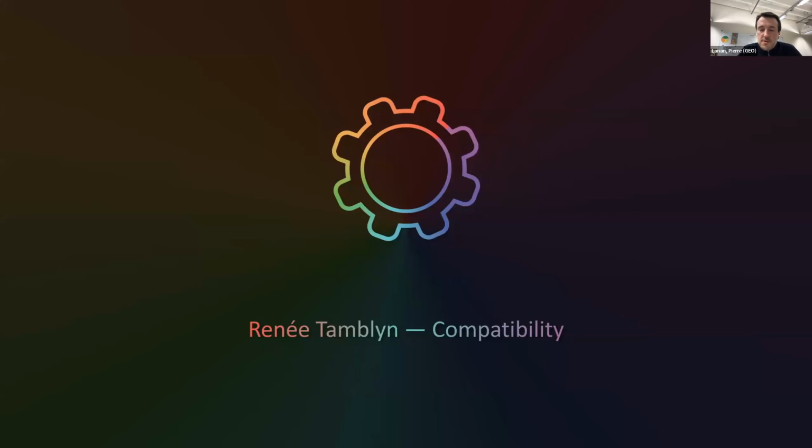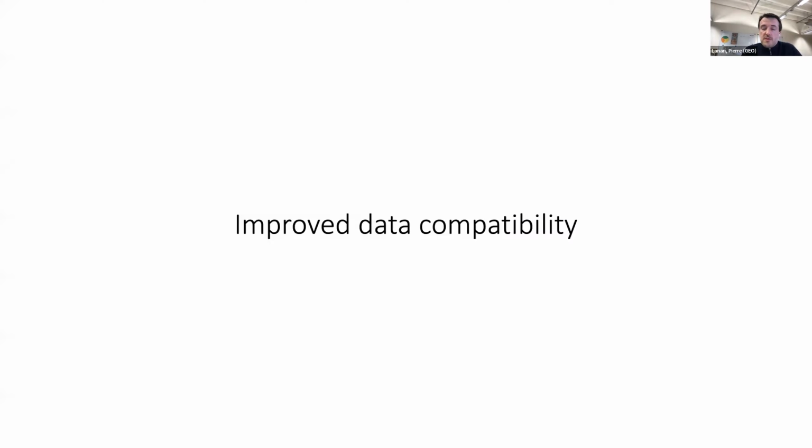Okay, thank you very much, Renée, and also Thorsten for showing us this converter module. If I sum up what you have shown, we have a slightly improved data compatibility compared to the previous version of XMapTools, where we added this log file generator, and you can try it with your own data. This is still work in progress. As Renée said, I'm very much looking forward to receiving new types of data and making sure that they will be compatible with the next version of XMapTools.